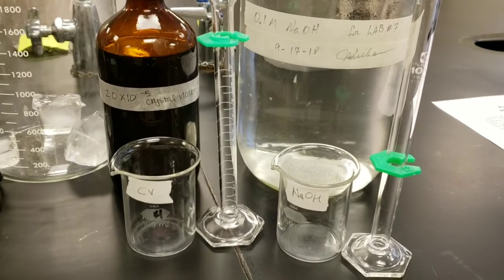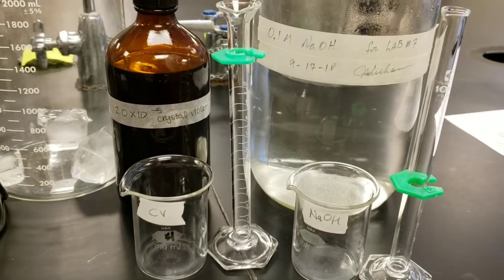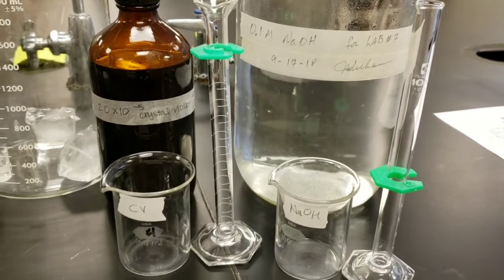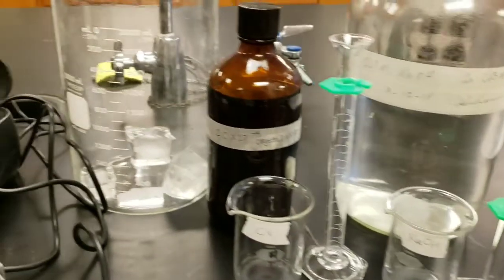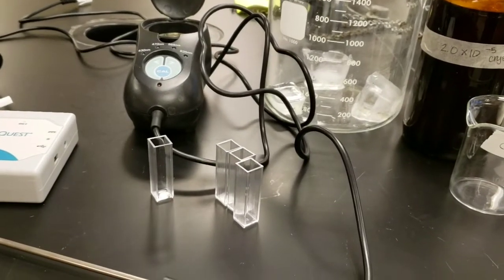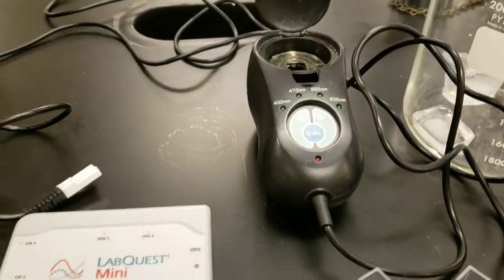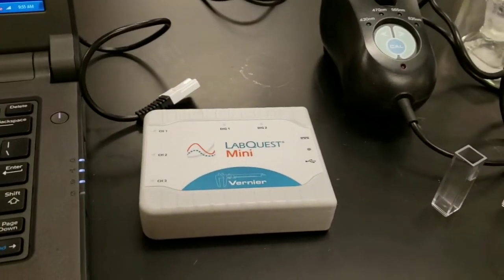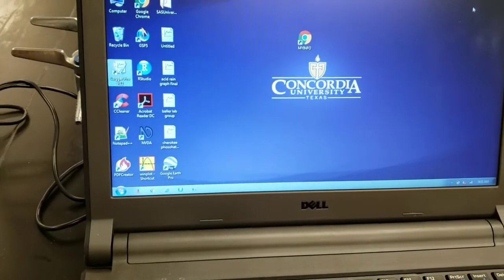For this experiment, you'll need dilute sodium hydroxide solution, dilute crystal violet solution, 2 graduated cylinders, 2 100 milliliter beakers, a large beaker with some ice, some cuvettes, a temperature probe, a Vernier colorimeter, the LabQuest Mini interface, and a computer that runs Logger Pro software.